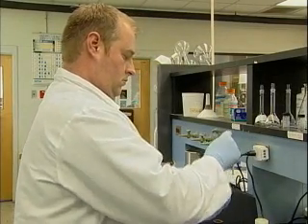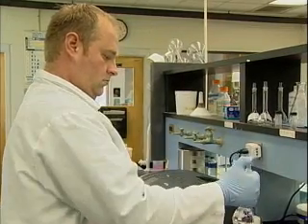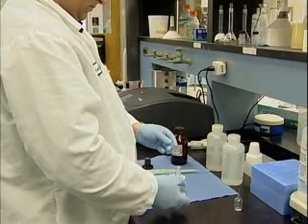Some of the tests that we run here in the lab are bacteria analysis. We run a bacteria sample on the drinking water. We may check for alkalinity, also we may check for chlorine, pH, and also metals analysis.